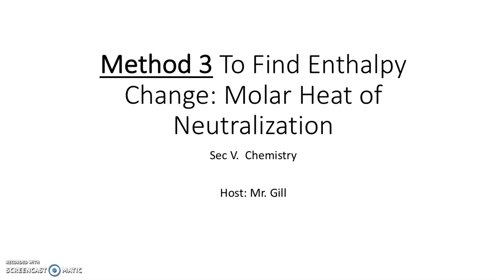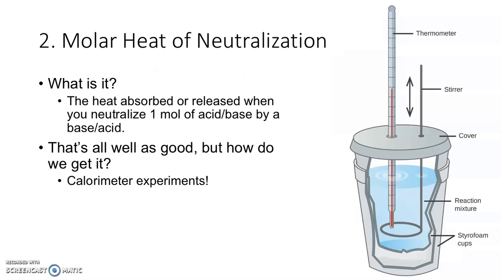You saw part 1 of chapter 6 that focused on molar heat by analyzing dissolution. This time we're going to find the molar heat of a reaction looking at neutralization. So again, the idea here is you have an acidic solution and a basic solution, both at the same temperature. They're going to be mixed into the calorimeter.